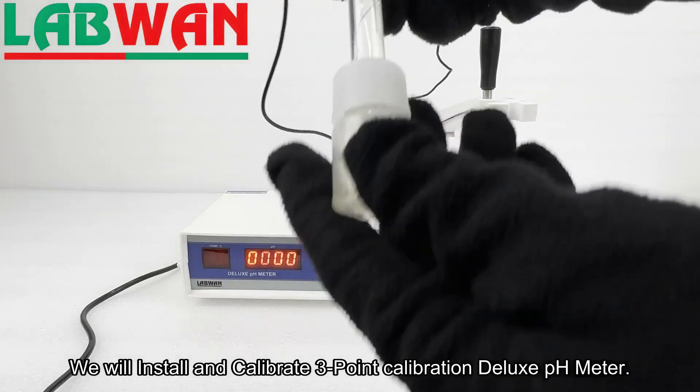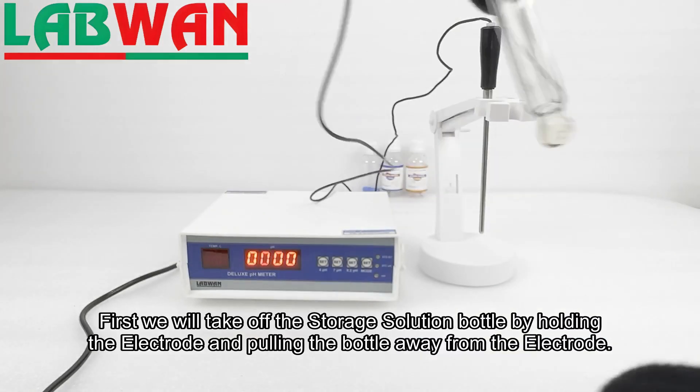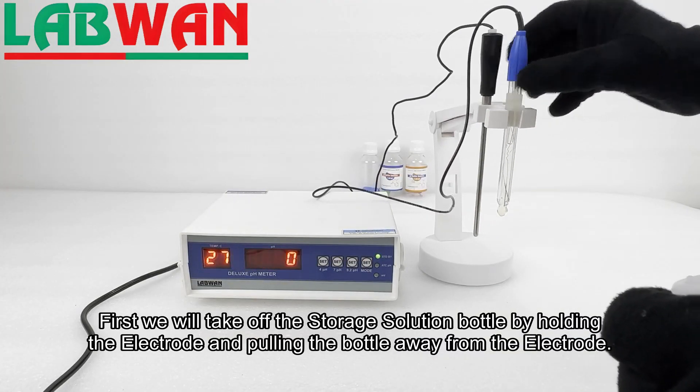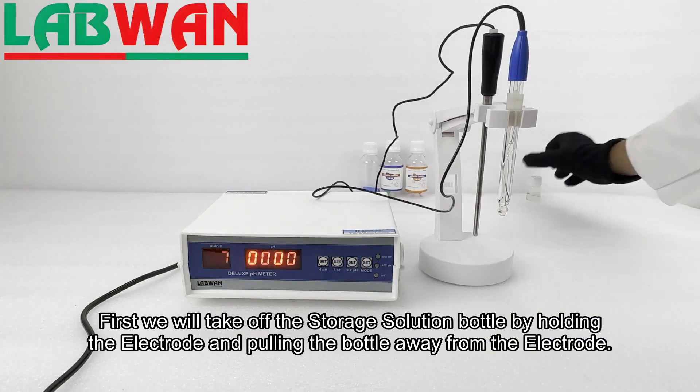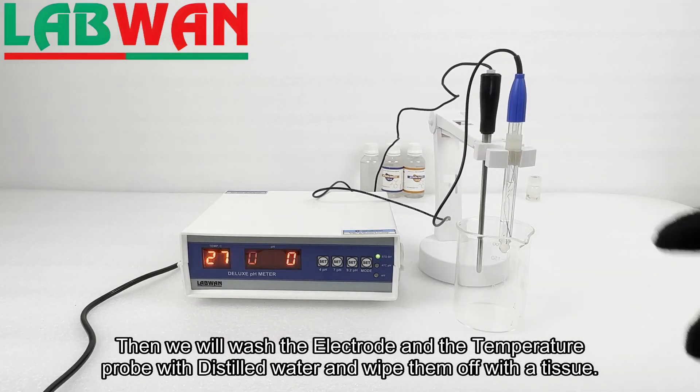We will install and calibrate a 3-point calibration deluxe pH meter. First, we will take off the storage solution bottle by holding the electrode and pulling the bottle away from the electrode. Then we will wash the electrode and the temperature probe with distilled water and wipe them off with a tissue.